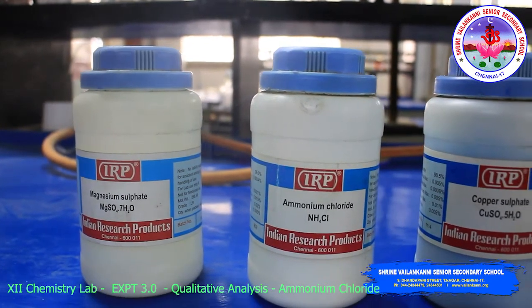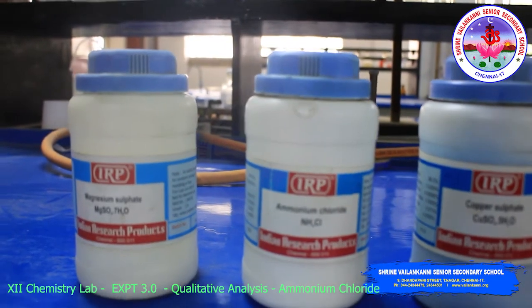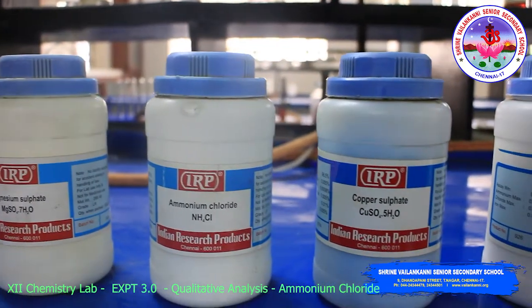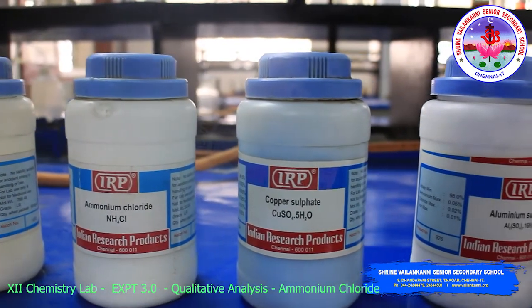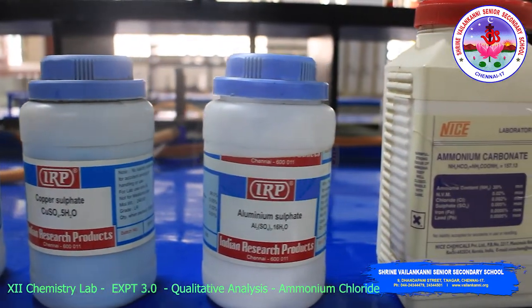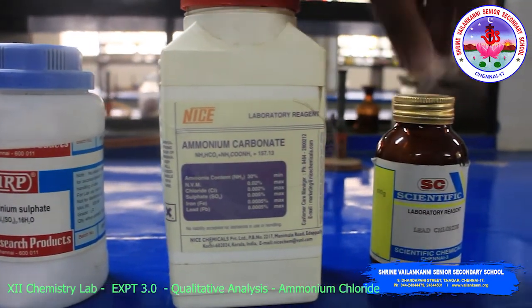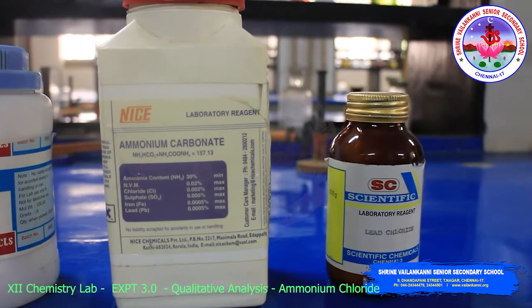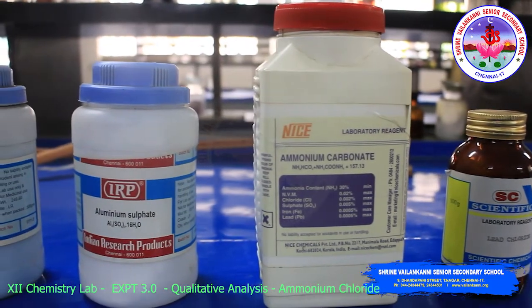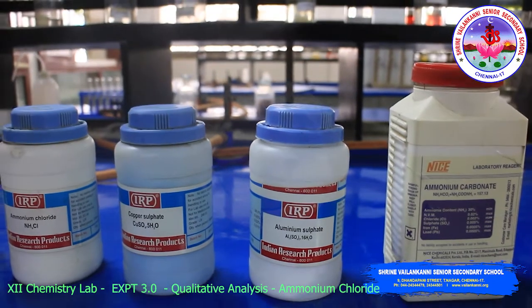Here I will show you, we are going to do these salts: magnesium sulfate, ammonium chloride, copper sulfate, aluminum sulfate, ammonium carbonate and lead chloride. These 6 salts we will do the confirmation test on here, but you have to do the systematic procedure. I will show you the confirmation tests for these substances.